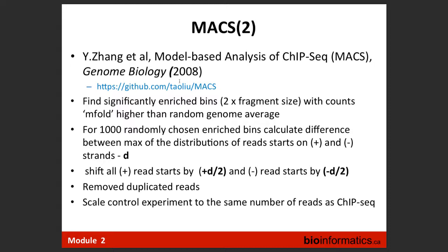However, there are so many of them, and they work in different directions, so that at the end of the day our data looks like some stochastic modification happened to it. We have proven multiple times that when we take DNA input, for example, assume that it's Poisson, and fit Poisson, the chi-square for that fit is just very, very bad. Out of 100 data sets, maybe one will be perfectly fit by Poisson. So what were people doing, people who are trying to beat MACS? What were the approaches? The following.